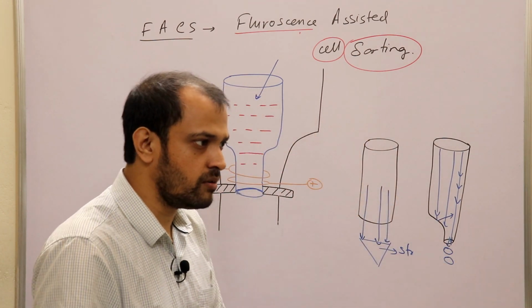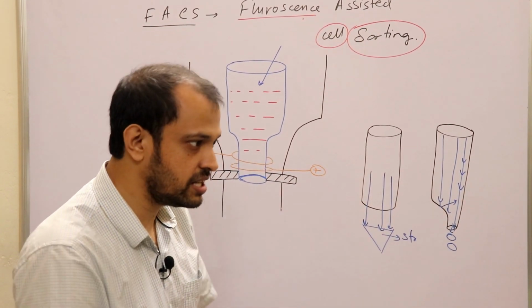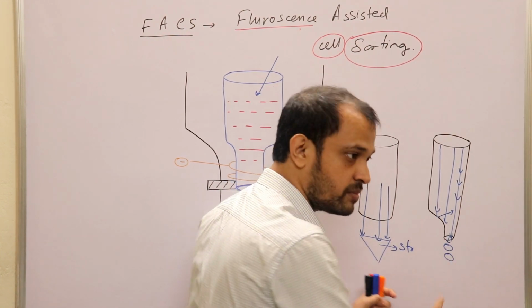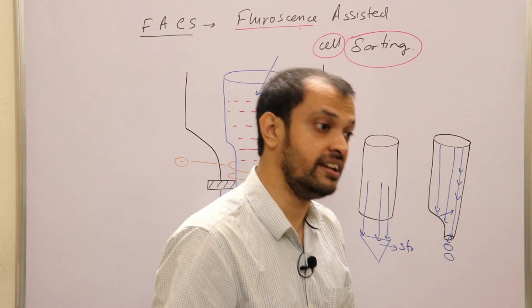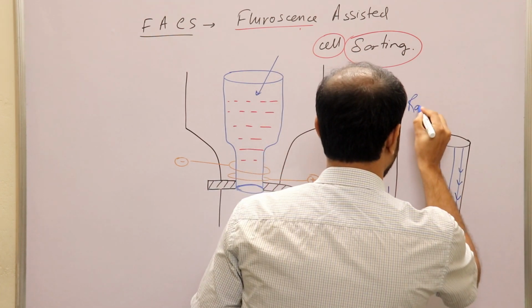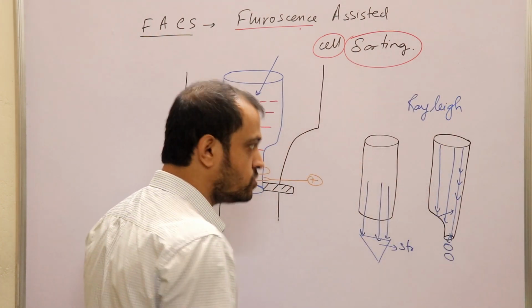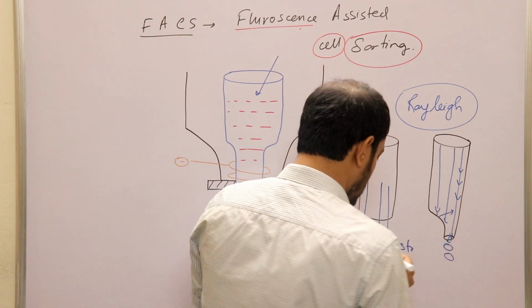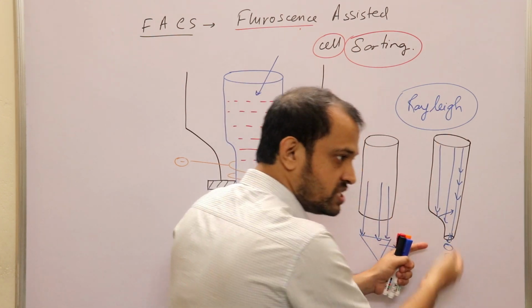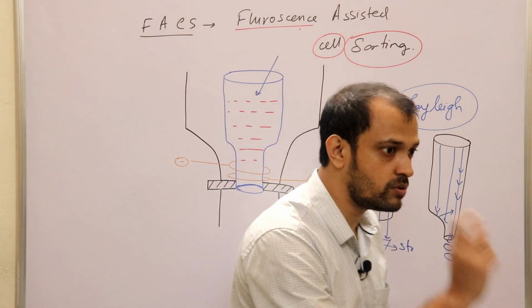And probably you are now hearing this thing, right? Probably you are now listening and learning this thing, but this whole phenomenon was discovered by Lord Rayleigh, who said that whenever a nozzle is introduced into a streamline flow, then the particular fluid which was previously undergoing streamline flow will have a tendency to break into droplets.